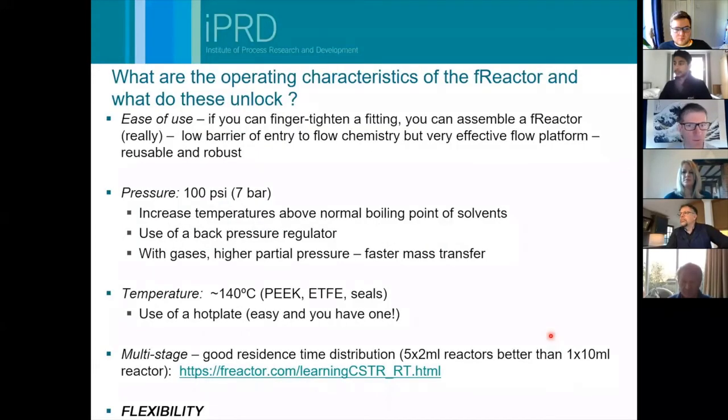So I just wanted to talk about the operating characteristics of the reactor and what these have really allowed us to unlock within IPRD. And what we're finding is that actually having these within the lab, people go to them without much prompting, they pick them up and they start to use them. They're very easy to use, okay?